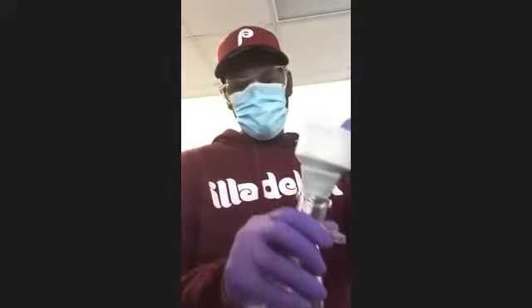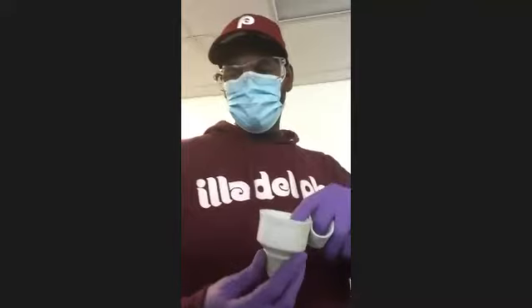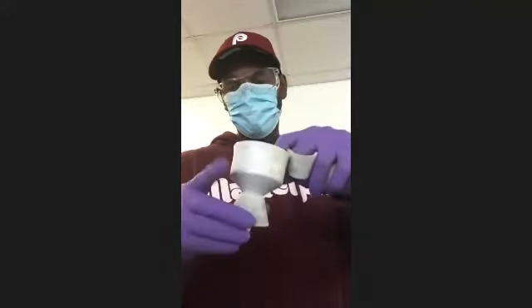funnel, and then you just sit it down in here, right? And if it's too big, if the filter flask is too big, you can flip it over like that and sit it on top. And both ways you're gonna get back either way. It doesn't matter. I think these filter flasks, the mouth on them is too narrow for these, but we're gonna make it work. Always make it work. So I'm gonna turn this around.